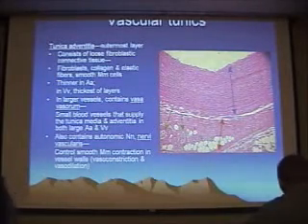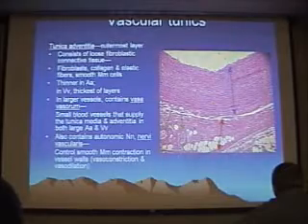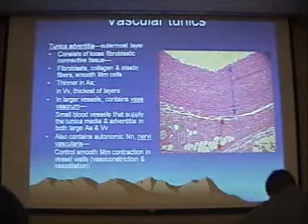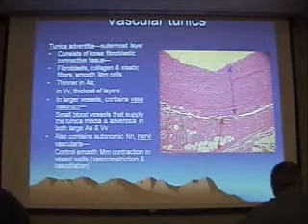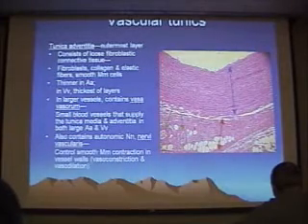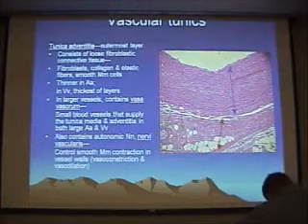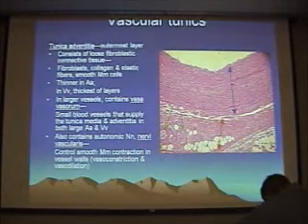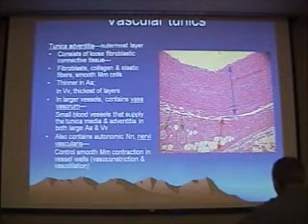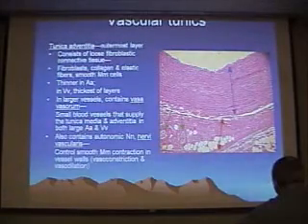In some vessels, like elastic vessels, that tunica can be just shot full of elastic fibers and then it will take on a somewhat grainy, rather different appearance. In these larger vessels, you can also have small vessels within the tunica adventitia itself — here we have some blood vessels which supply the muscle of the media. You can also sometimes see small nerves, the nervi vasorum, which control vasomotion.